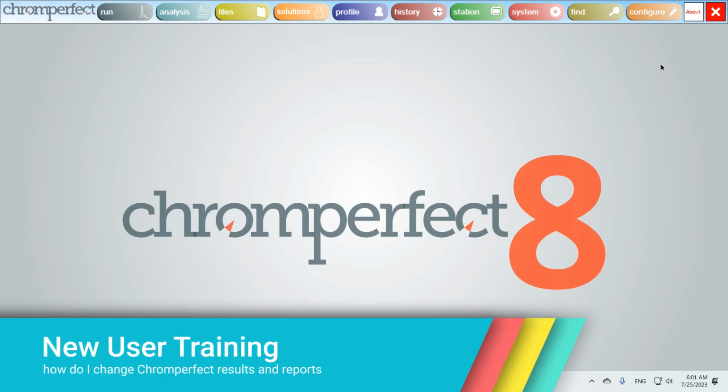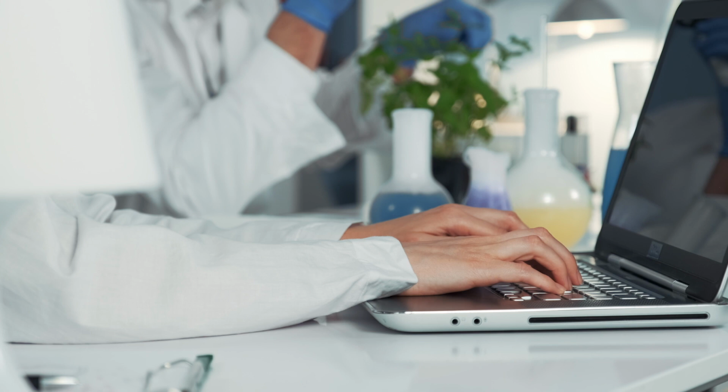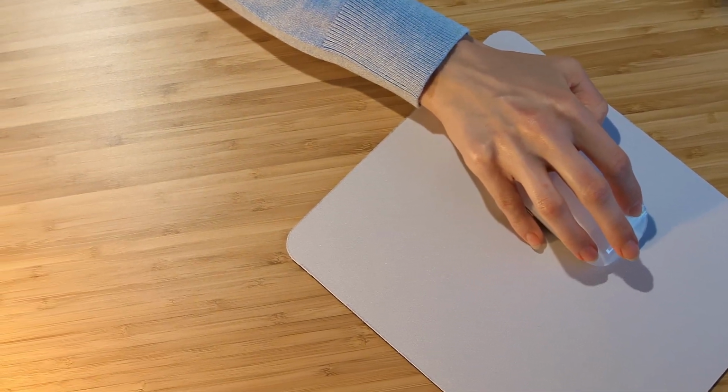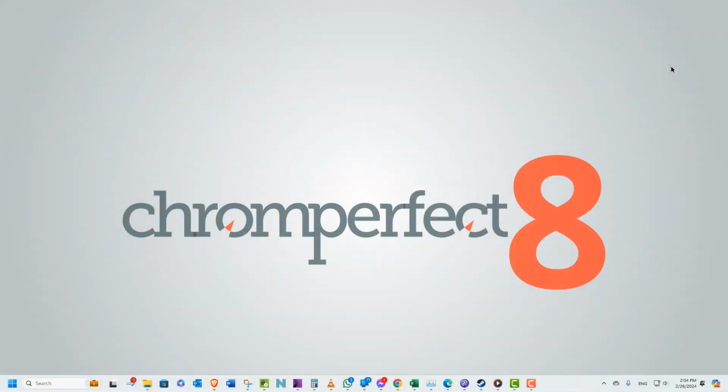In this video we are going to look at how Chromperfect produces final reports and how changes can be made to the output. New users often join a laboratory where Chromperfect has already been installed and configured. Most customers will use the software to generate calculated results, normally in the form of some type of report. This report could be digital or, commonly, a printed report sent to the printer. It can be confusing to a new user how these results have been generated and how they can make changes or adjustments to the final reports.